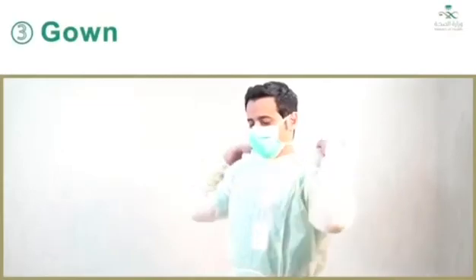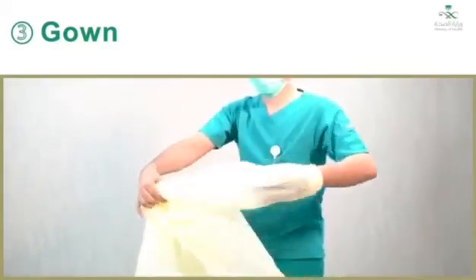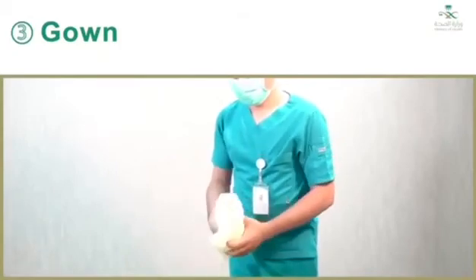3. Gown. Gown front and sleeves are contaminated. If your hands get contaminated during gown removal, immediately wash your hands or use an alcohol-based hand sanitizer. Unfasten gown ties, taking care that sleeves don't contact your body when reaching for ties. Pull gown away from neck and shoulders, touching inside of gown only. Turn gown inside out. Fold or roll into a bundle and discard in a waste container.